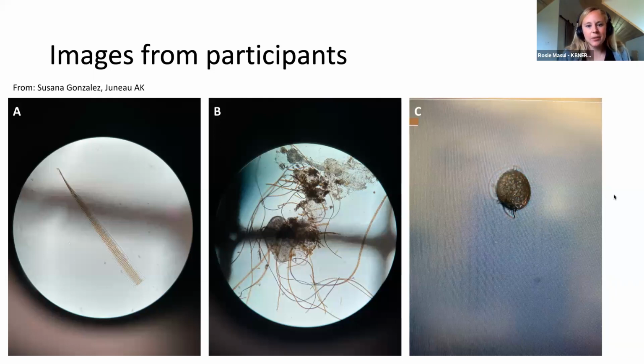One of the things that I use as well, depending on how you're looking at your samples: for us, we have our little slide cover on, and if you nudge the edge of the slide cover with a pencil, sometimes the cells will roll for you. Obviously, if it's something that's chained up, that might not happen. But for a single-celled organism, especially a dinoflagellate, you might get it to roll, and then taking some photos, especially looking at how the plates are connected, can really help with the identification later on.